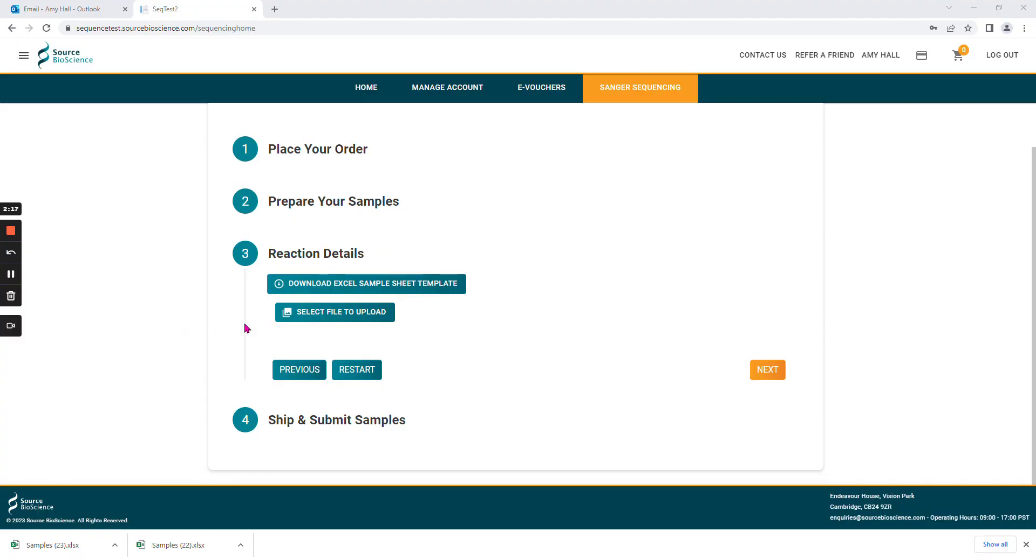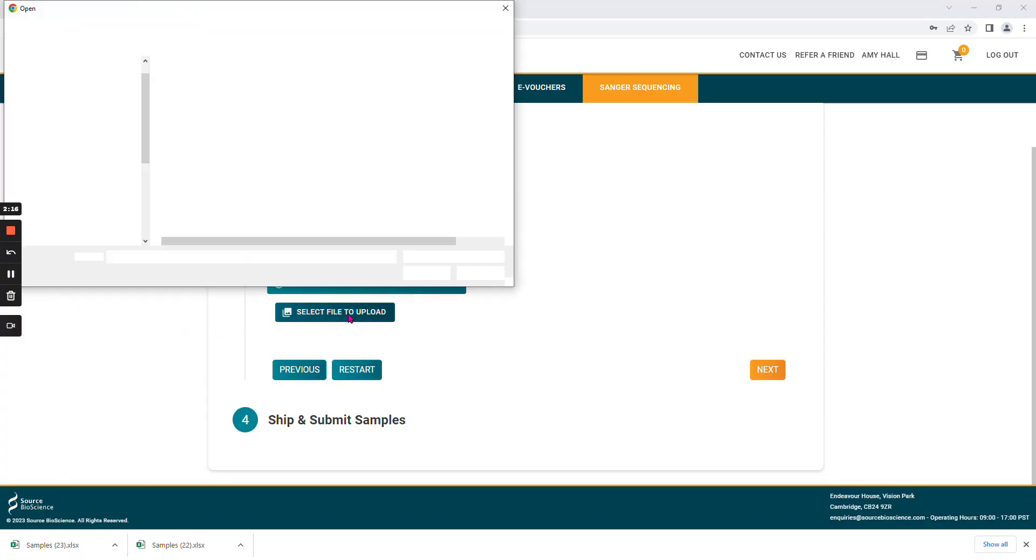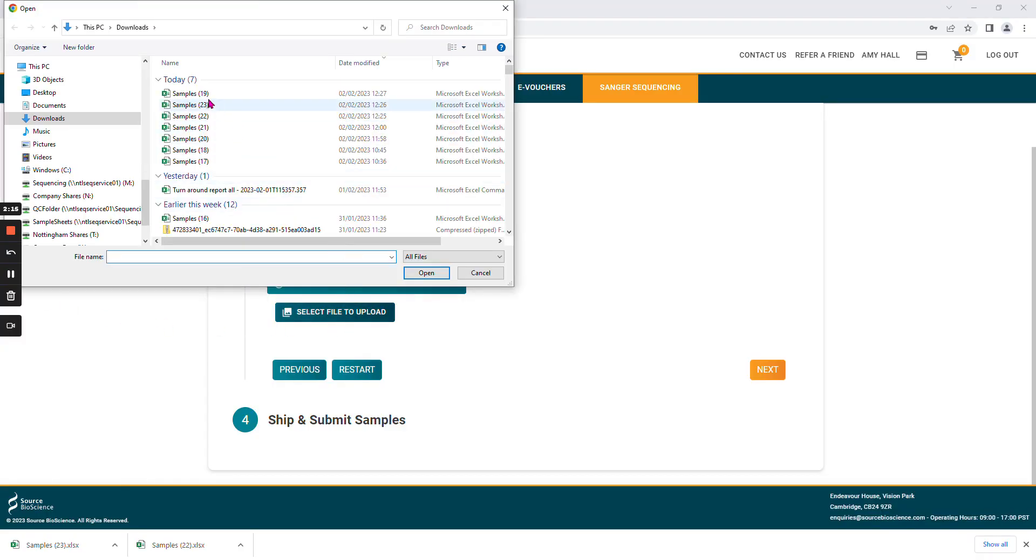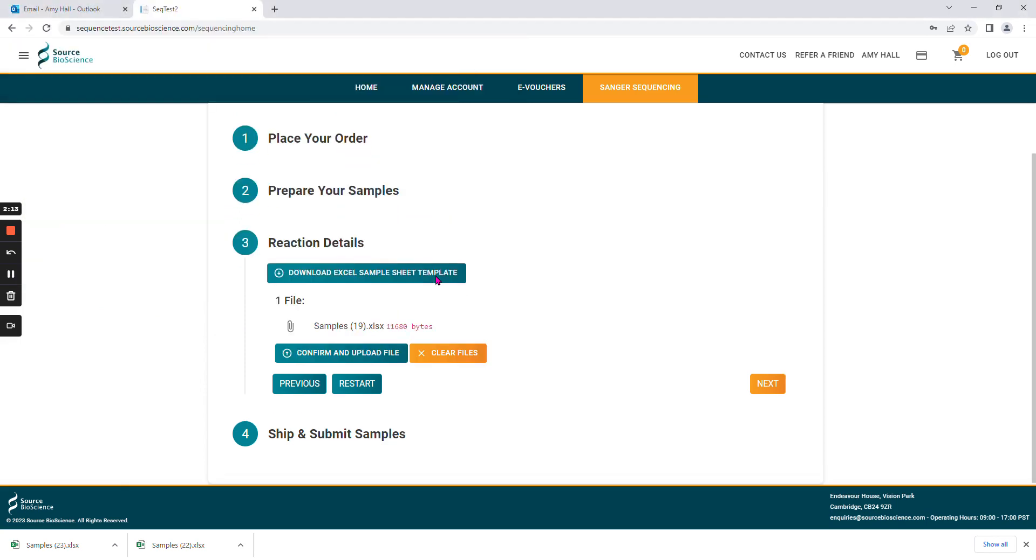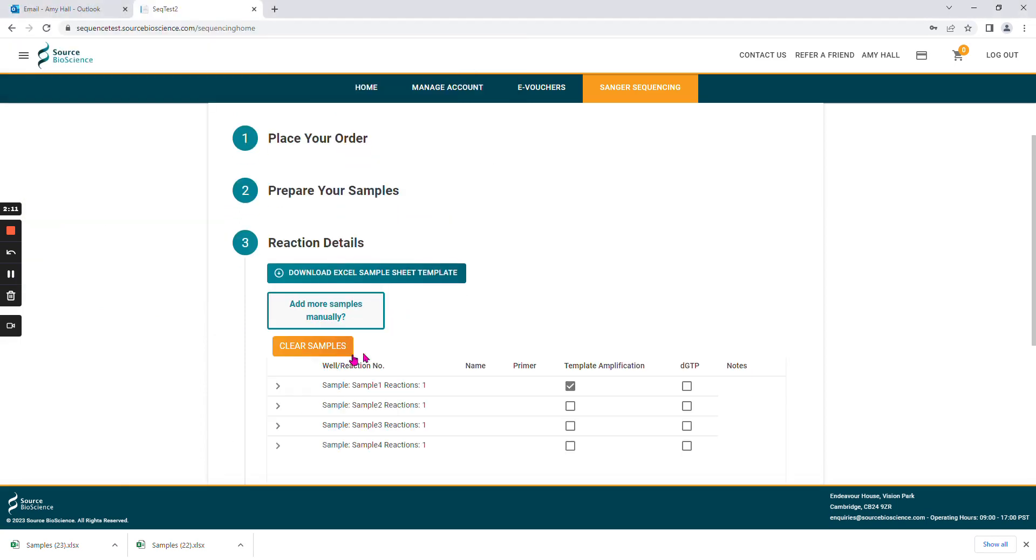On the website, choose to upload your file, find the correct file, and confirm and upload it.